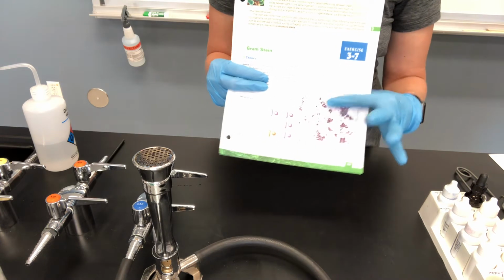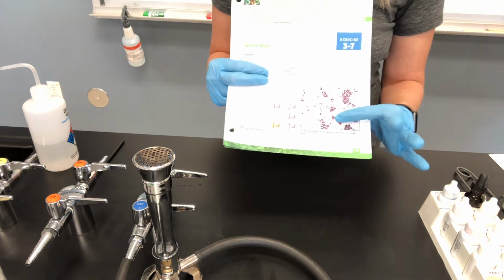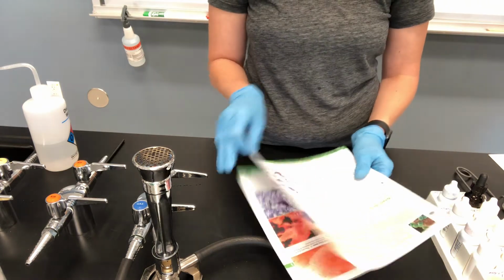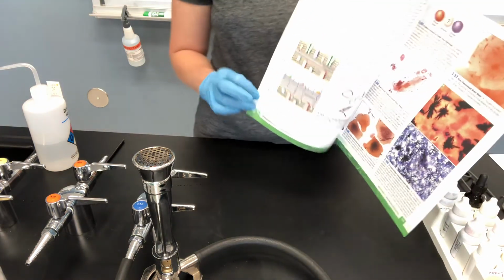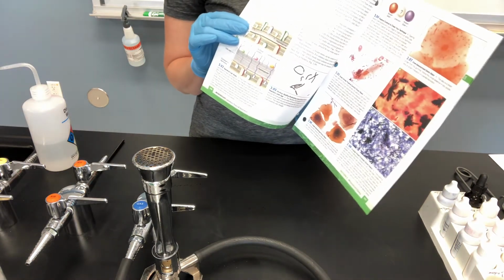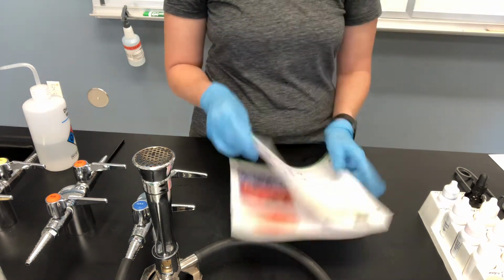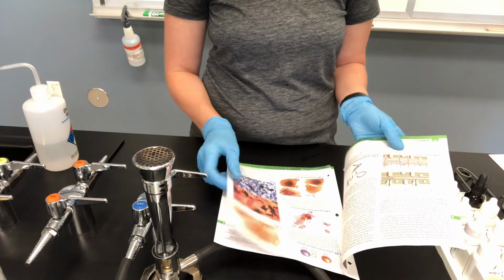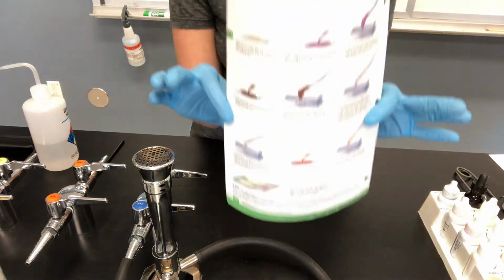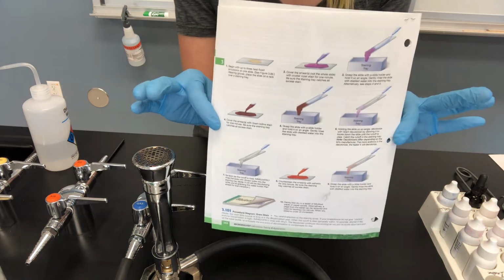This picture here is showing you a mixed slide. It has both gram positive purple and gram negative pink cells on that slide. There's a lot of background information showing the difference between the cell wall structure, and then just some diagrams and pictures to help you understand some pitfalls that people go into. I'll let you read through that. I'm not going to spend the time on that here. I want to focus on walking you through the process of the gram stain.